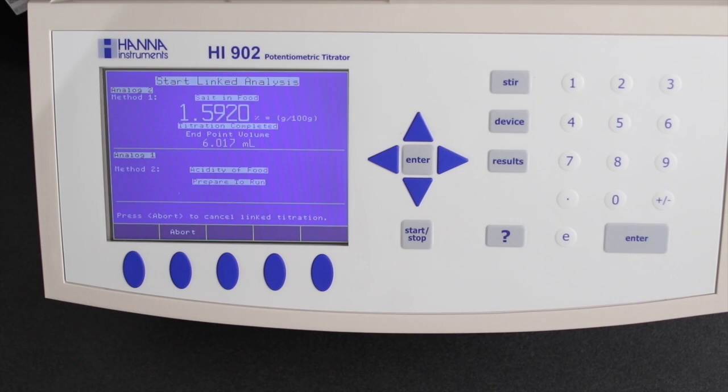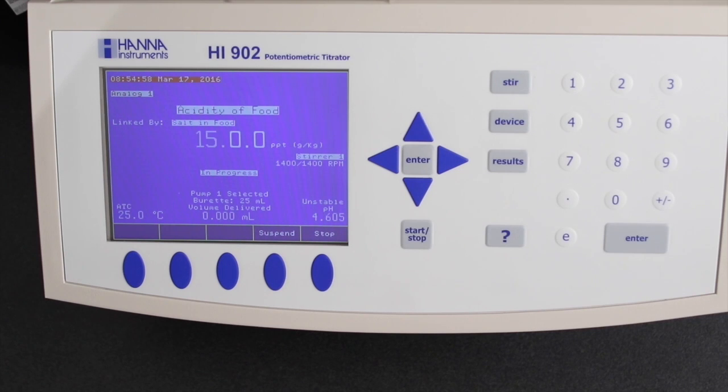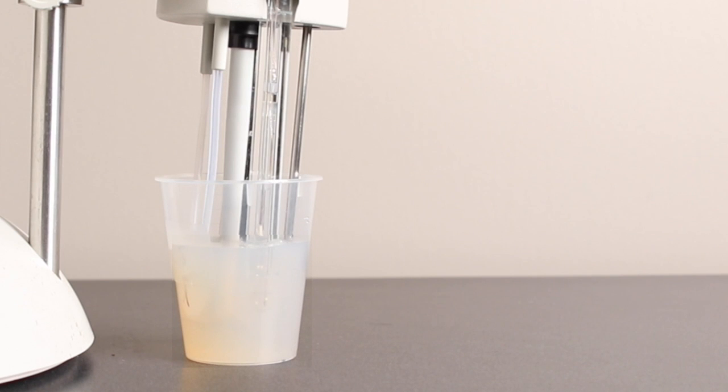Titratable acidity will start automatically once the salt titration is finished. This acid-base titration will bring the pH to 8.3 using 0.1 normal sodium hydroxide.